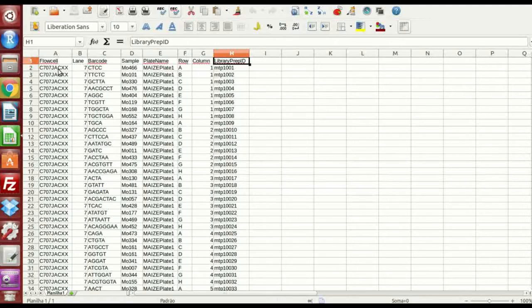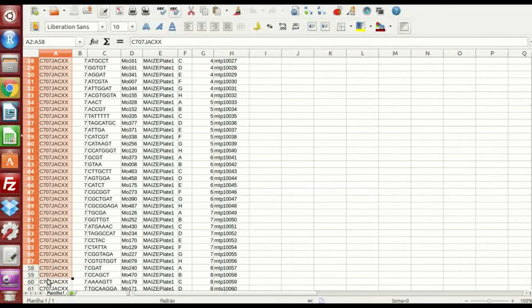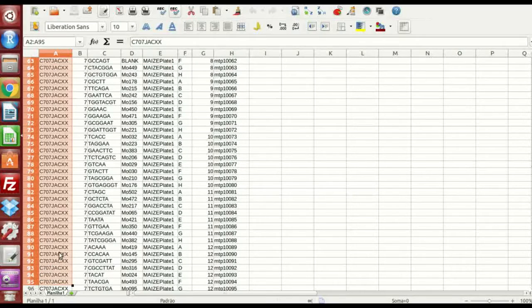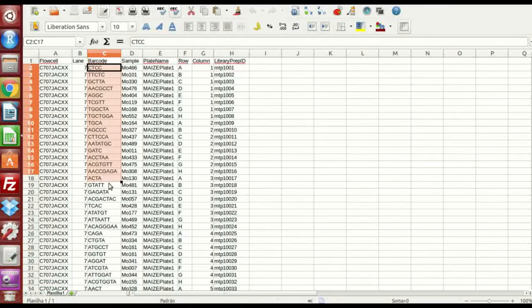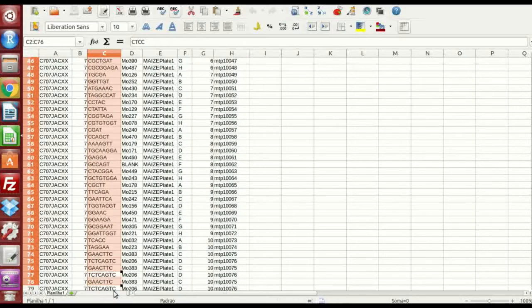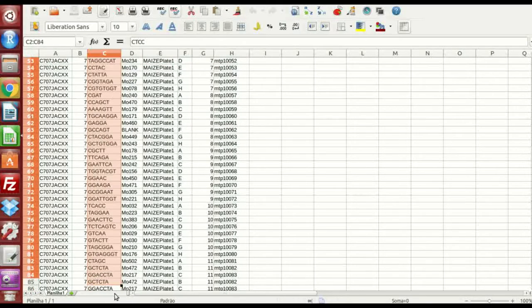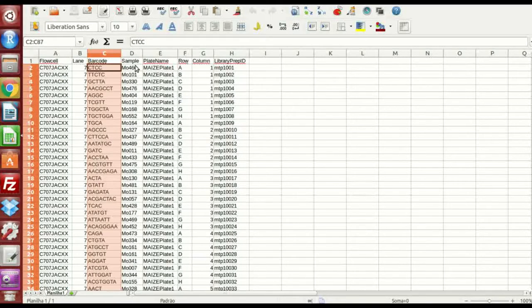So, the flowcell, it is respect to the sequencing used, the lane too, the barcode the lab should give to you, which barcode you use for each genotype. You have the sample. The sample is the name you give them.